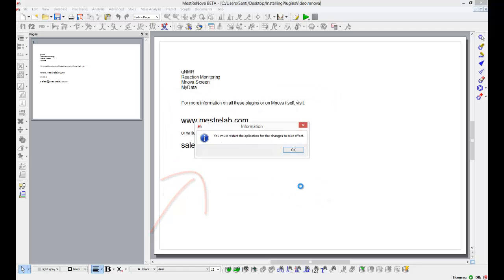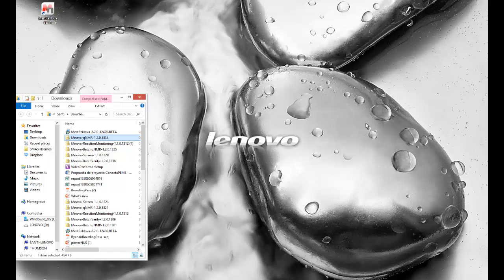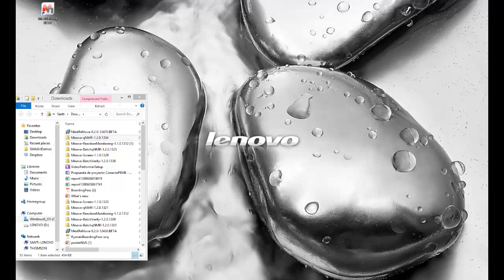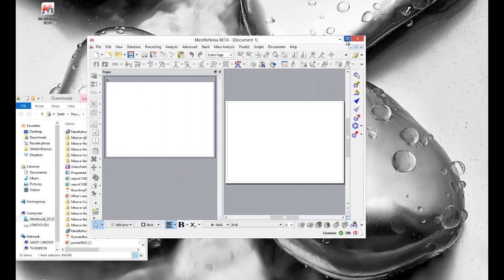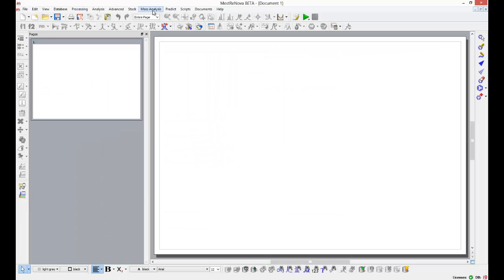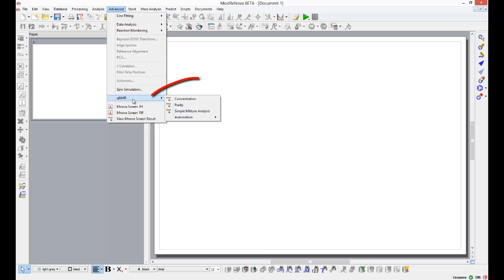I click on install, voila, this is all I have to do. Now, if I restart the application, the QNMR functionality will have been added to my MestreNova and all the QNMR functionality will be available to me through the advanced menu.